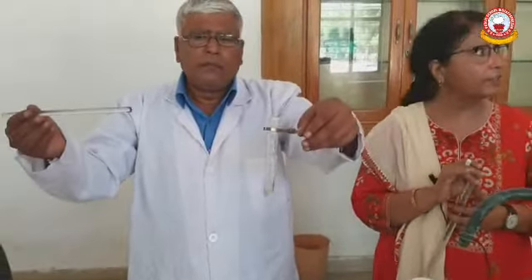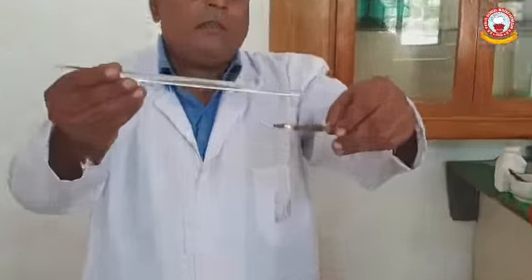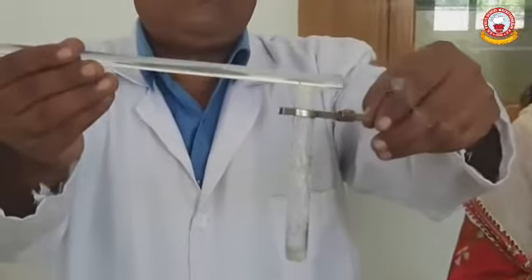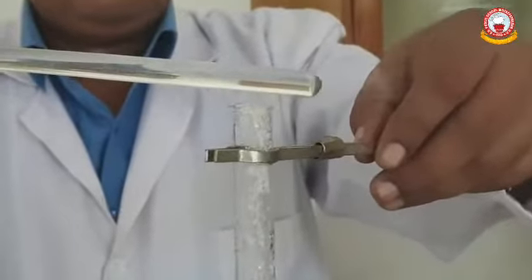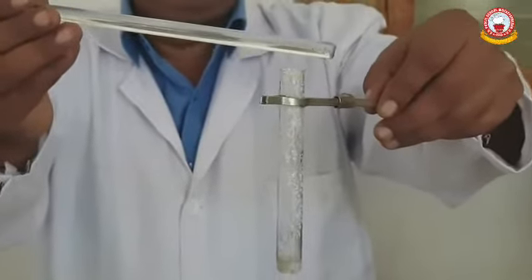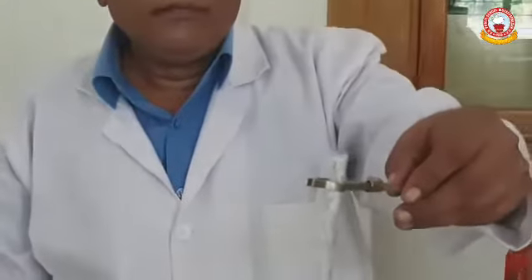So, as I have discussed, the pungent vapors are of HCl, and now a rod dipped in ammonia we bring near the mouth of the test tube and you get white fumes of ammonium chloride, and white vapors increase. It shows that chloride is present.